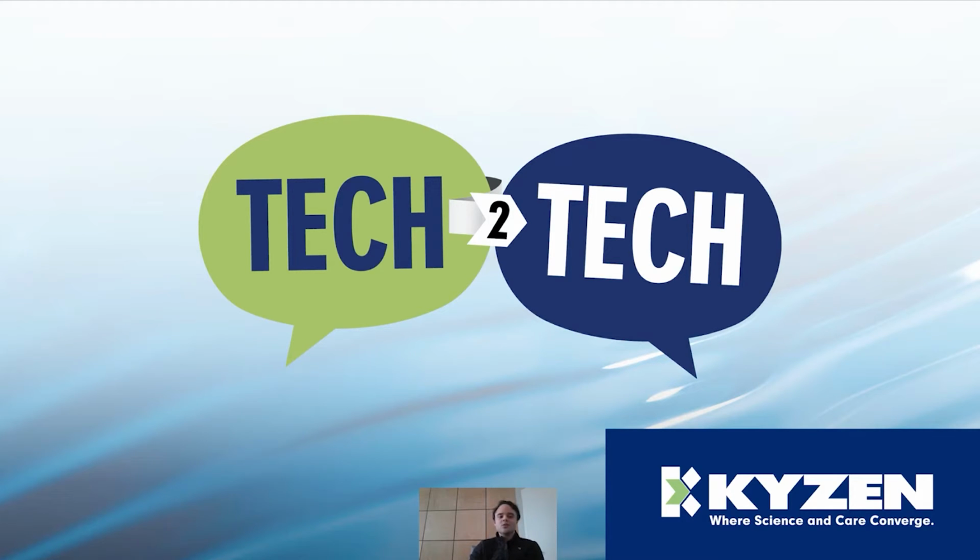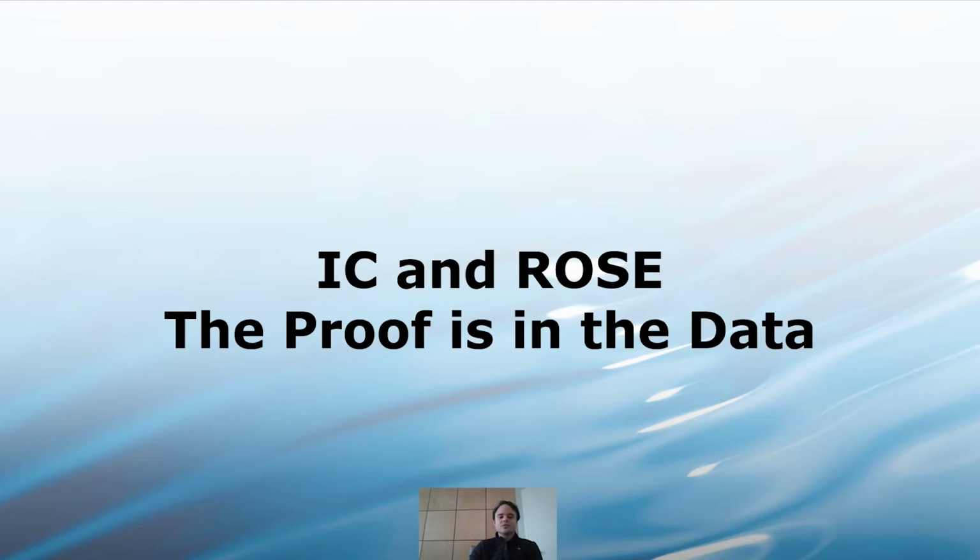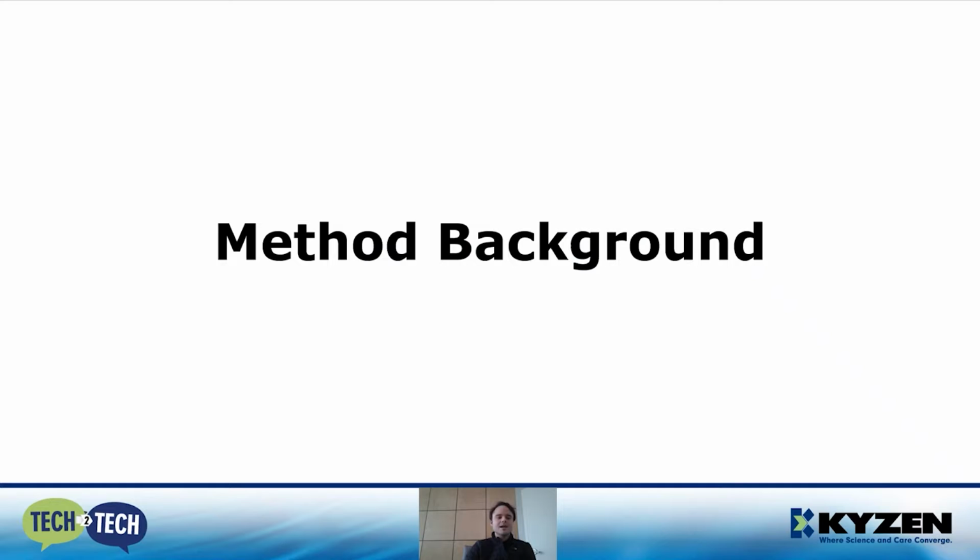This presentation is on two commonly used bulk extraction techniques that measure ionic contaminants, ROSE and IC, and their specific use cases. As it turns out, ROSE and IC have quite different use cases. But before we get into that, let's take a look at the background of both methods.